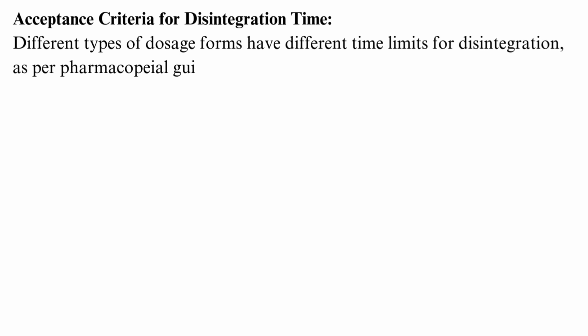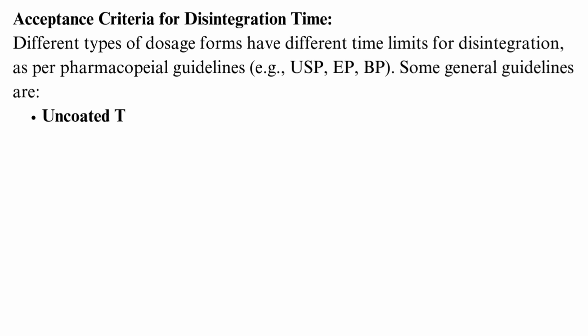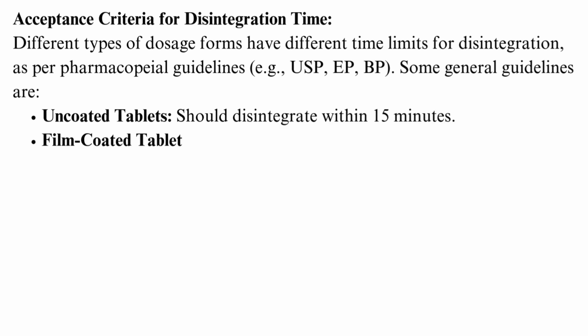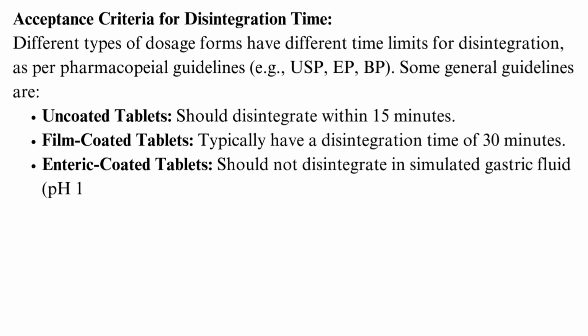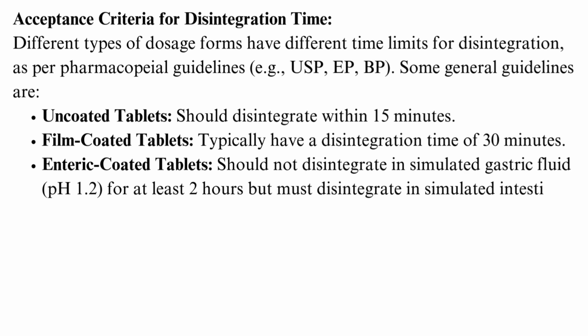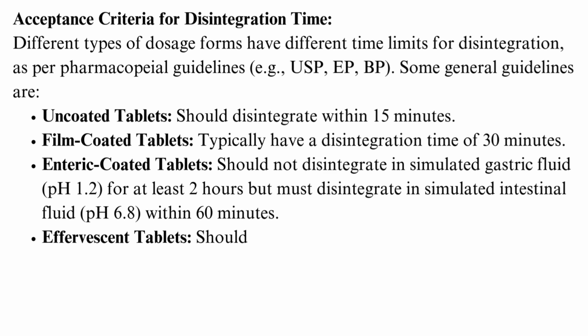Different types of dosage forms have different time limits for disintegration, as per Pharmacopeial guidelines. Some general guidelines are: uncoated tablets should disintegrate within 15 minutes, film-coated tablets typically have a disintegration time of 30 minutes, and enteric-coated tablets should not disintegrate in simulated gastric fluid, pH 1.2, for at least 2 hours but must disintegrate in simulated intestinal fluid, pH 6.8, within 60 minutes.